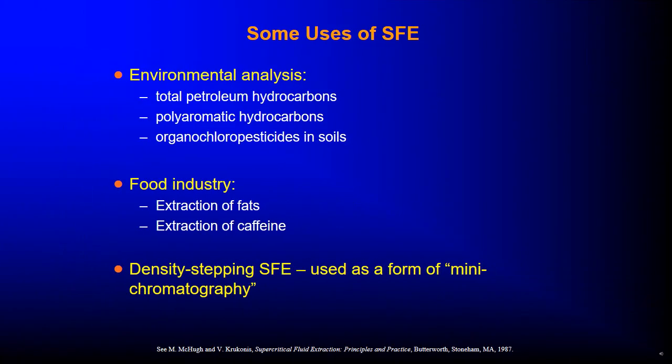Some uses of supercritical fluid extraction: environmental analysis, total petroleum hydrocarbons, polyaromatic hydrocarbons, organochlorine pesticides in soils. Then in the food industry, we have extraction of fats and extraction of caffeine. Then density stepping supercritical fluid extraction is used as a form of mini chromatography.